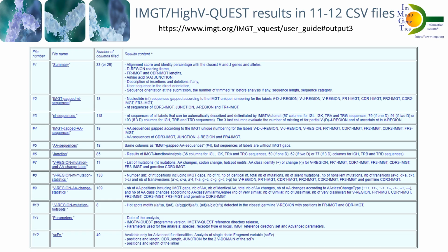The available documentation can be reached through this link, and this table indicates for each file its number, its title, the number of columns it contains, and the main data it includes. You can access the exhaustive list of the columns of a given file just by clicking on its title.